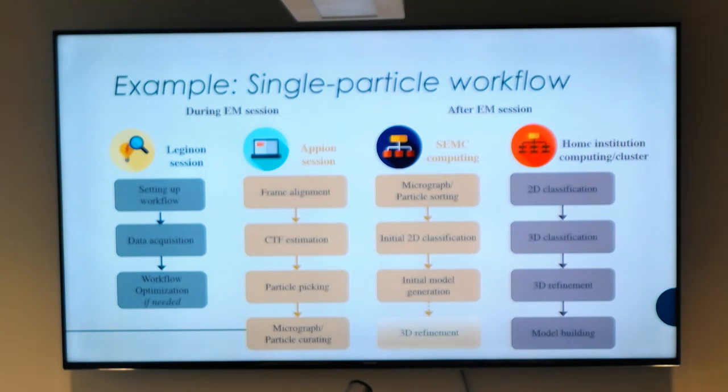In addition, don't feel that you only have to do one step once. Like, this has to be the perfect CTF and I'm only going to run it once. This has to be the perfect particle picking, I'm only going to run it once. I'm going to do only one refinement. That's unlikely to be the case unless you actually have really worked out your data set or are working on, like I say, the test data set that we're working at. On most data, you'll be working at it multiple different ways, and you might be going through different points.